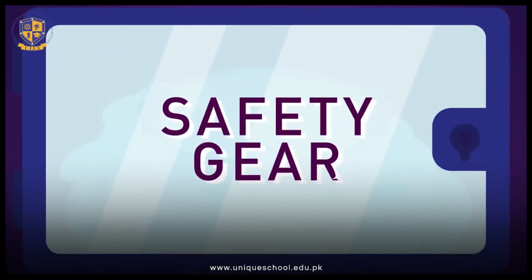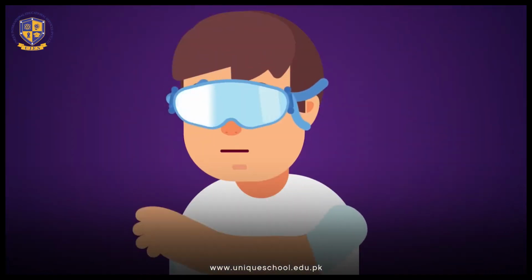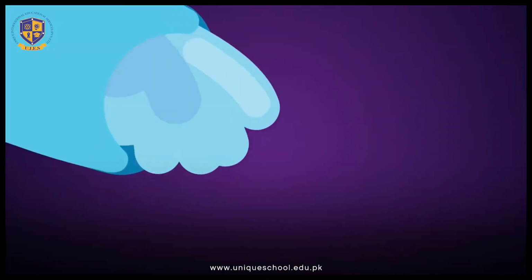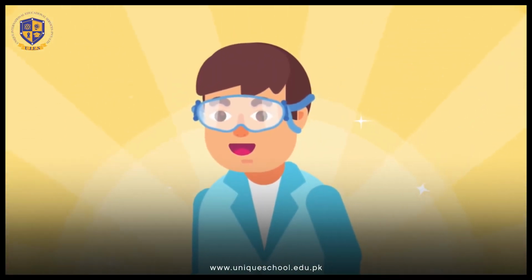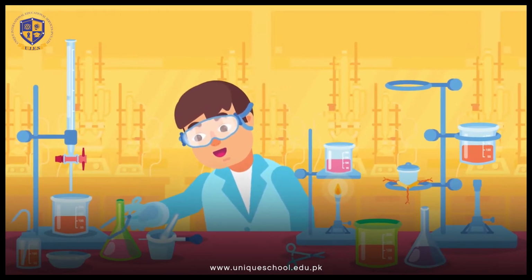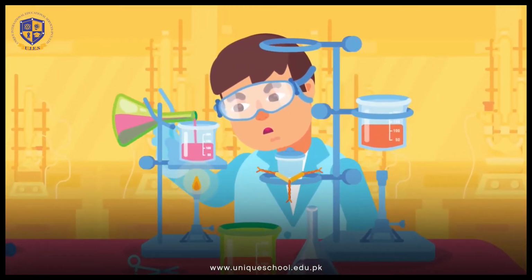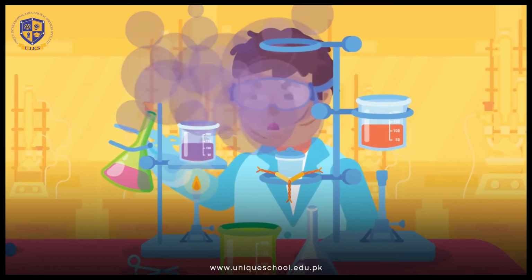Safety gear. One of the major things we often ignore is wearing safety gear. This includes goggles, a pair of latex gloves, and a lab coat. This not only makes you look cool and makes you feel like a responsible scientist, but also protects you from all kinds of chemicals you may be coming into contact with, knowingly and unknowingly.